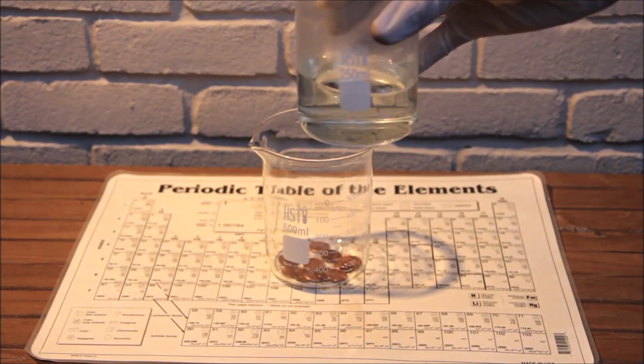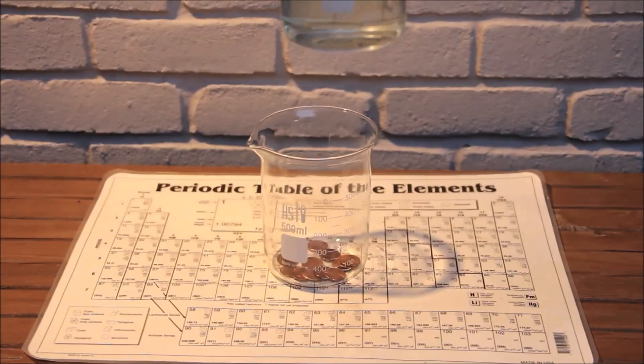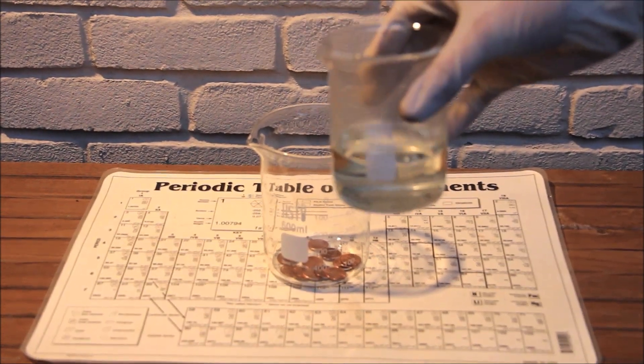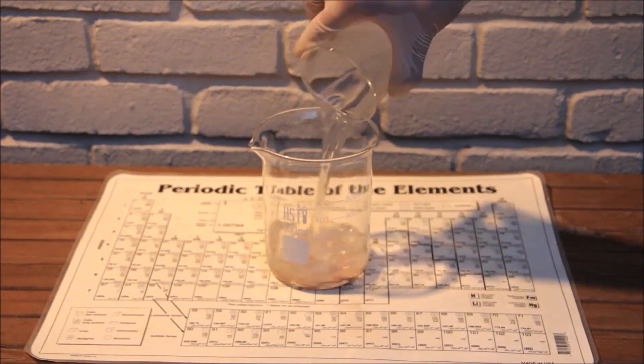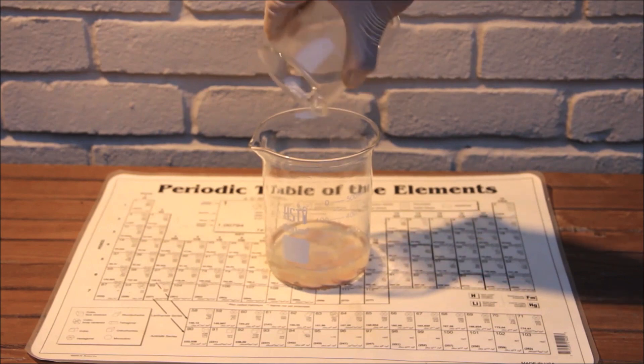You will also need a strong acid, such as hydrochloric acid or sulfuric acid. Here I have 31.45% hydrochloric acid, purchased as muriatic acid from the hardware store.